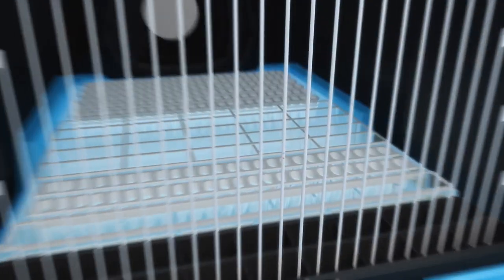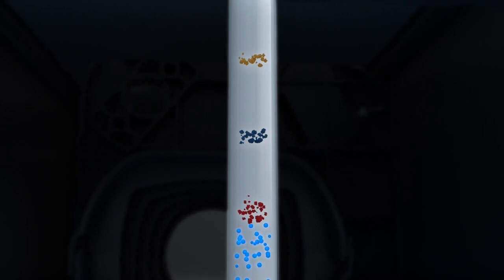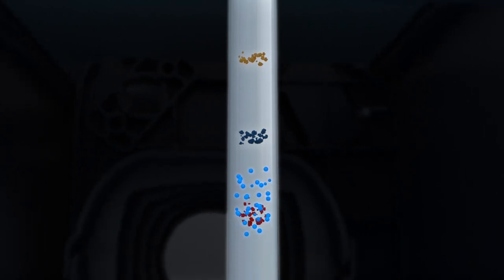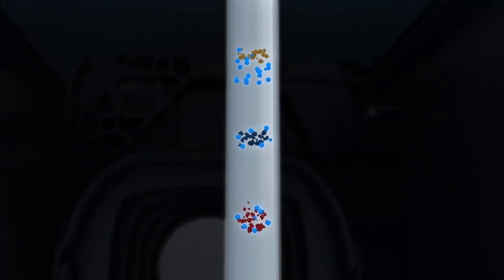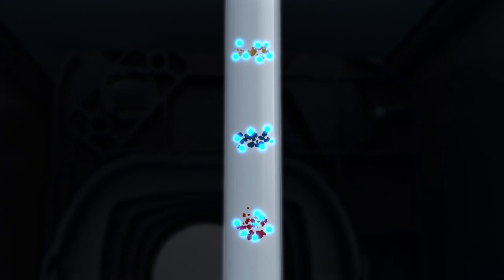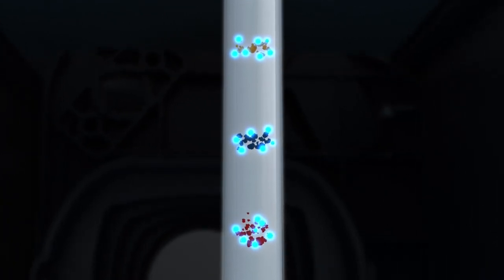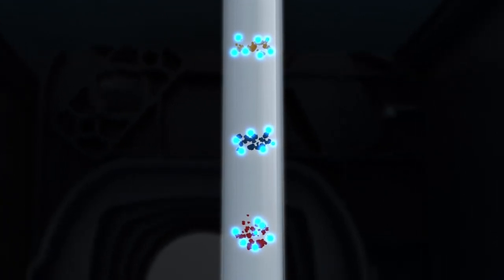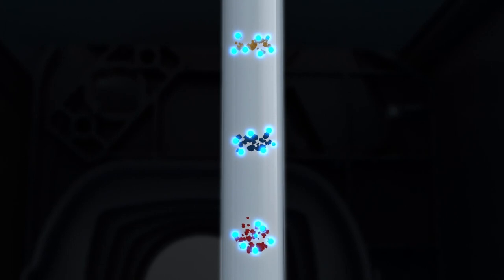Protein normalization has never been easier with Jess. Just load her protein normalization reagent into a row of wells on the plate, and she'll take care of the rest. The fluorescent labeled reagent reacts with amines on proteins, enabling a between-capillary comparison of protein load.